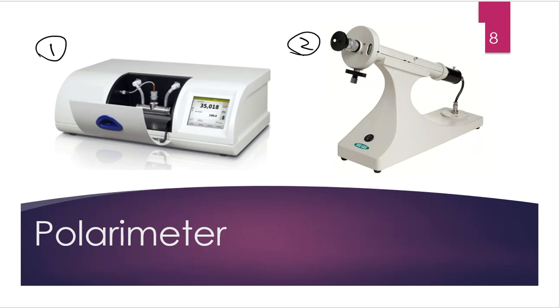I want to talk about the right-hand side one first. This is more of the manual option that happens in a polarimeter read. The orientation is kind of flipped, but all the pieces and parts are there. You're seeing this cord, and this cord is directed up here into this black box. This is where the bulb is going to be, and the first lens is going to be right here. So that filtering lens is going to take that sodium D lamp and filter it into that one direction that we talked about.